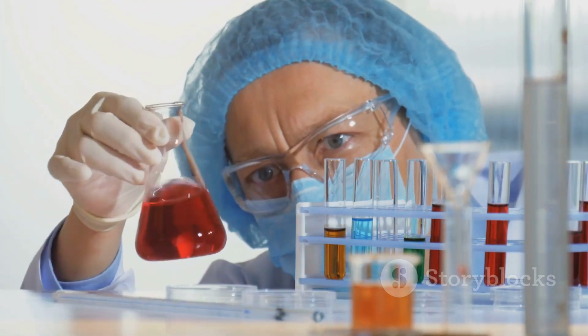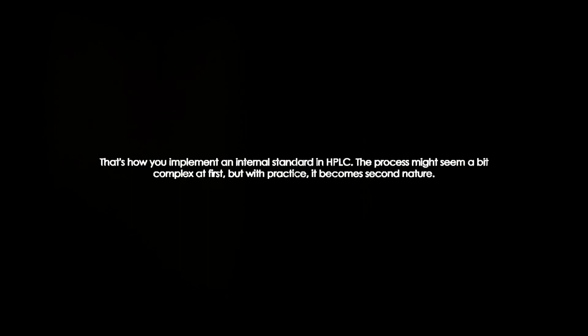The final step involves using the internal standard to calculate the amount of analyte in the sample. This is done by comparing the response of the analyte to the response of the internal standard using a calibration curve. And there you have it. That's how you implement an internal standard in HPLC. The process might seem a bit complex at first, but with practice, it becomes second nature. By carefully selecting and implementing the internal standard, we can significantly enhance the accuracy and reliability of our HPLC analysis.